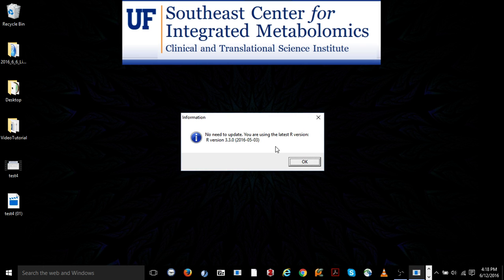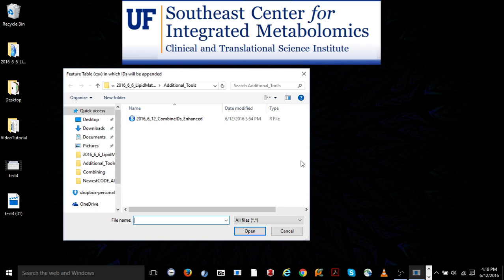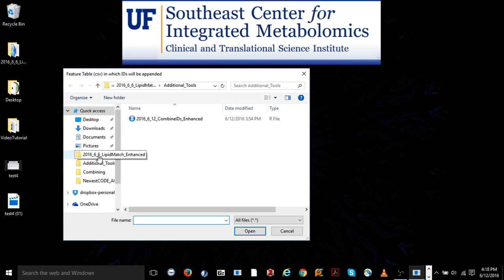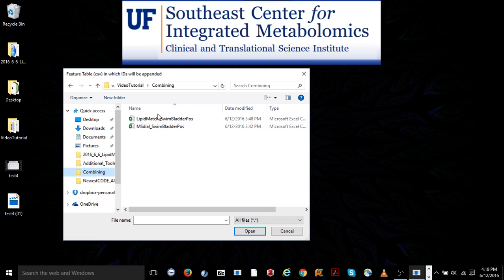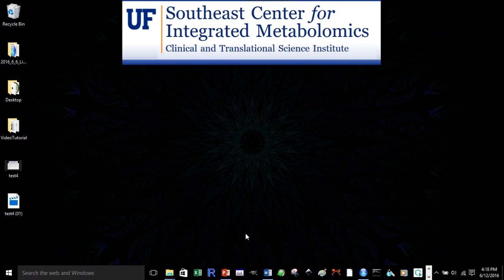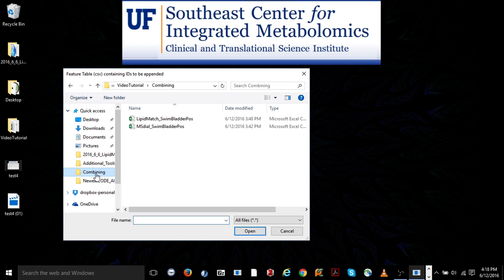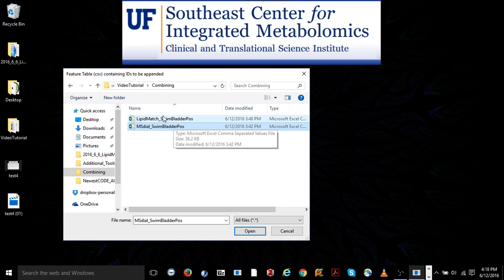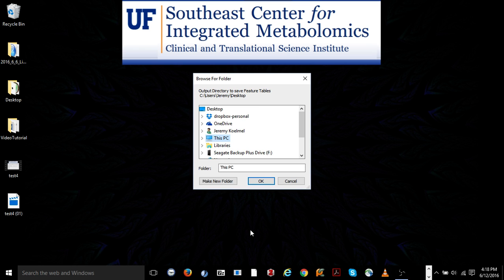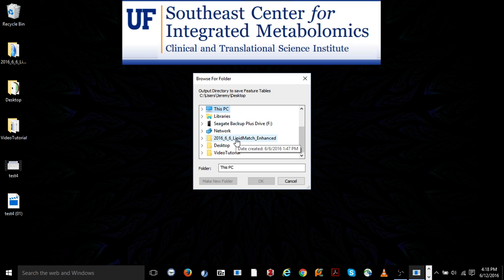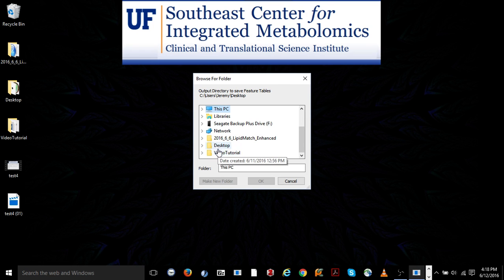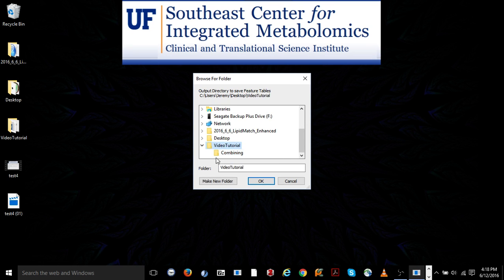Now, it's going to ask us a series of questions. First, it's just showing that we have the latest version of R. Now, it's asking for the feature table in which IDs will be appended. So, that's going to be our lipid match feature table. Now, it's going to ask for the feature table containing IDs to be appended. So, in this case, it's the MS dial that has the identifications that we want to append onto the lipid match table. Now, it's going to ask us for our output directory to save the feature tables. The output directory, in this case, I'll have is the same as the input directory.